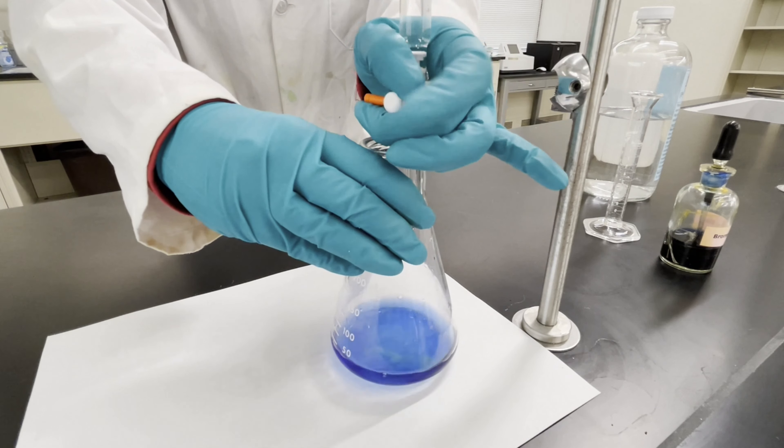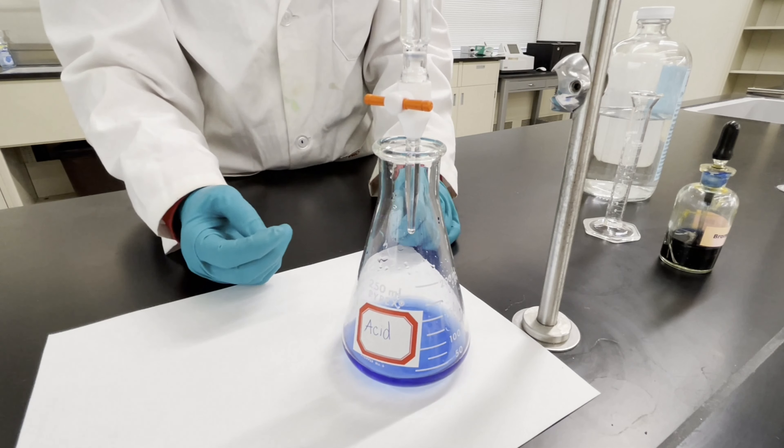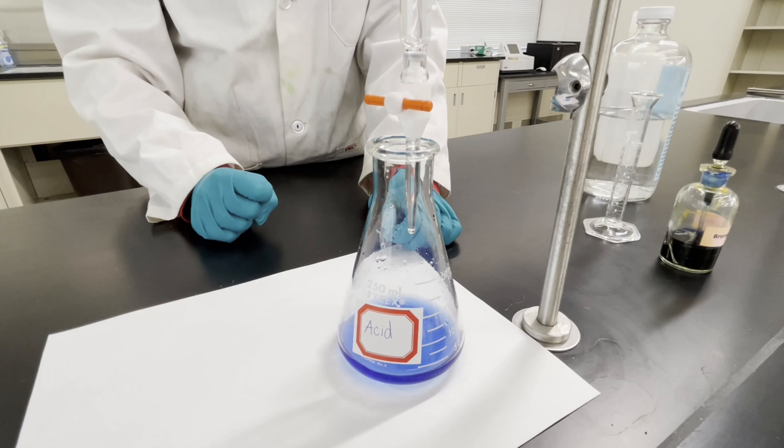Once you add that final drop, it'll turn completely blue. That's how you know you're done your titration. Then always make sure to measure the end volume of your burette.